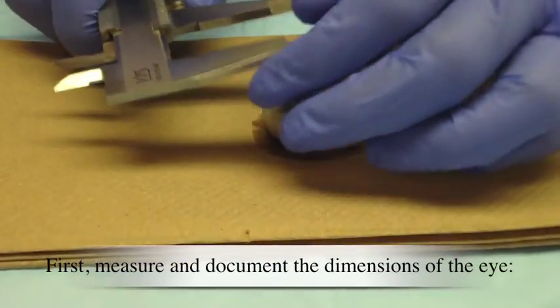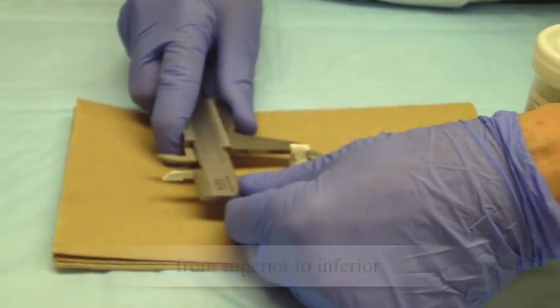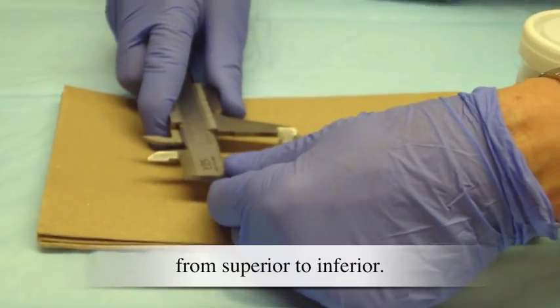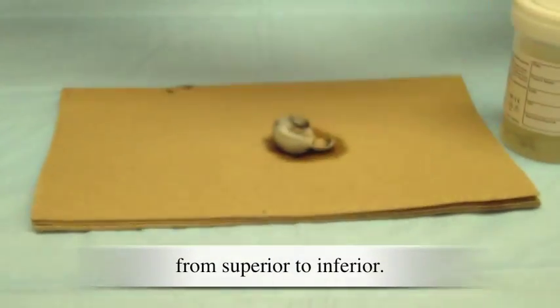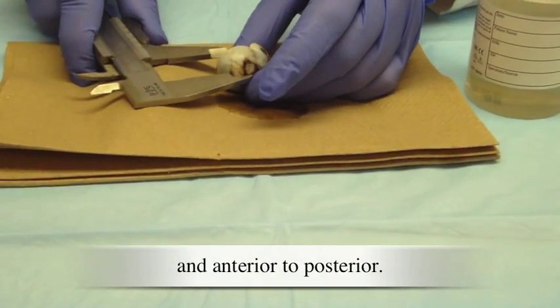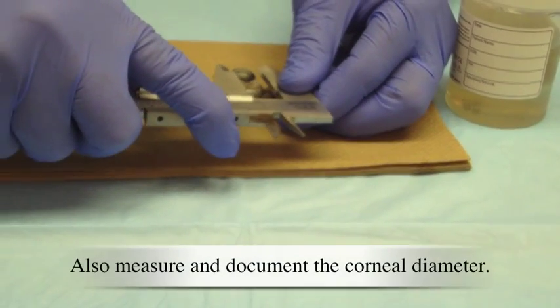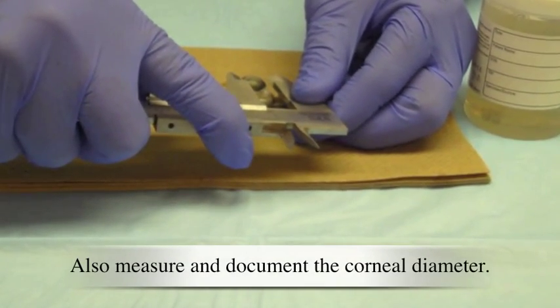First, measure and document the dimensions of the eye: from superior to inferior, and anterior to posterior. Also measure and document the corneal diameter.